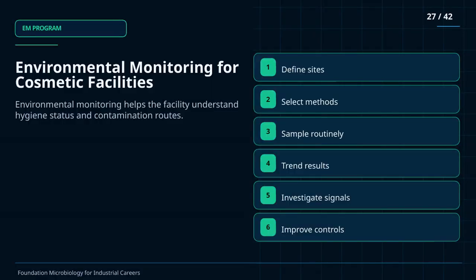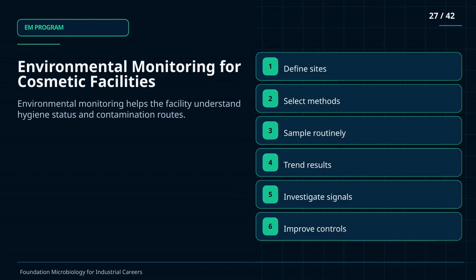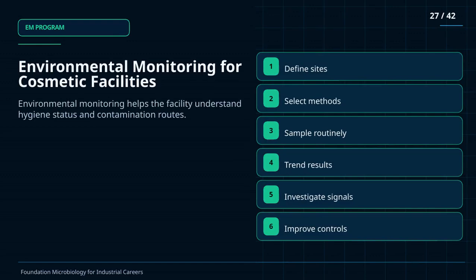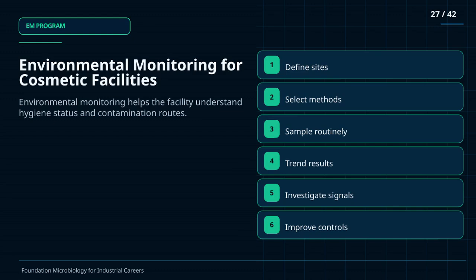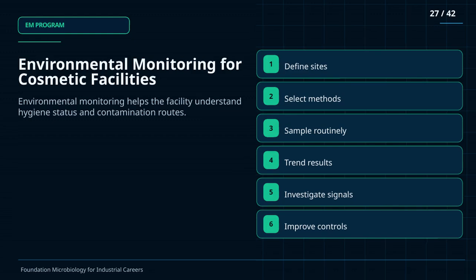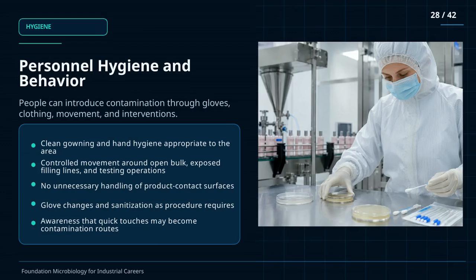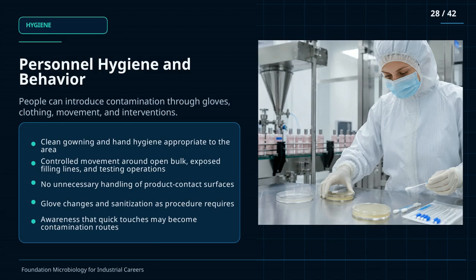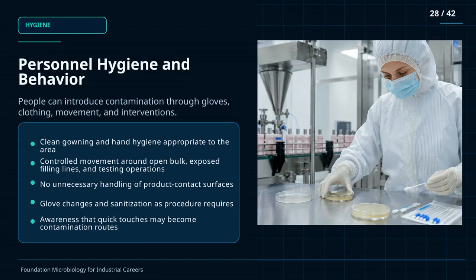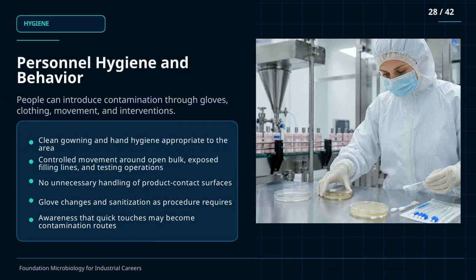The Cosmetic Microbiology Laboratory manages sample receipt, preparation, dilution, neutralization, plating, incubation, counting, and reporting. Its data support release decisions, investigations, product development, and ongoing quality monitoring. Microbiology is connected to the consumer experience because contamination can affect odor, texture, color, and stability. Laboratory data should therefore inform formulation, production, packaging, QA decisions, and complaint investigations.